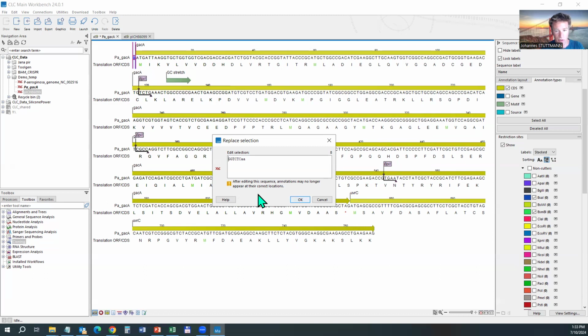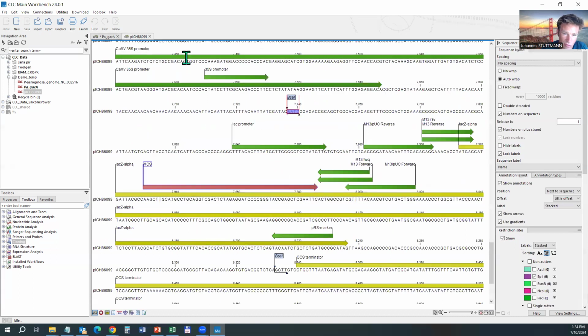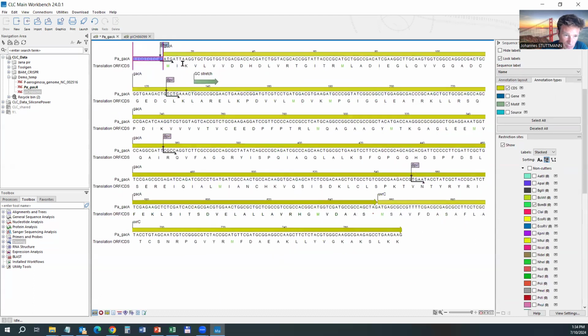Then as well, the restriction enzymes generally like to have something to stick to at the end. So we put an additional 2 T nucleotides. Again, this is random on this side. This would be now something that would be a proper adapter to actually be able to clone this into this plasmid. So these adapters in the lab, I would add them by PCR.